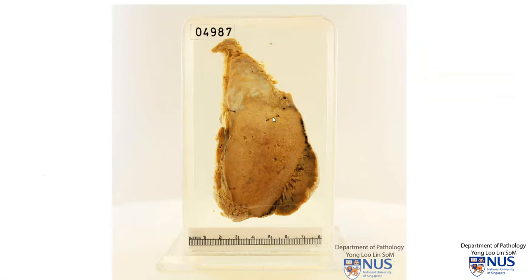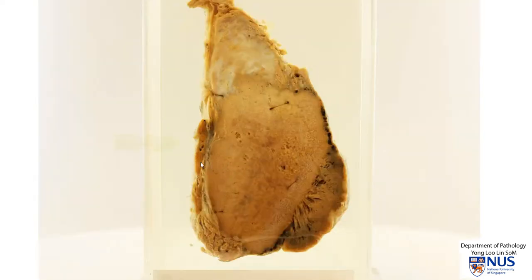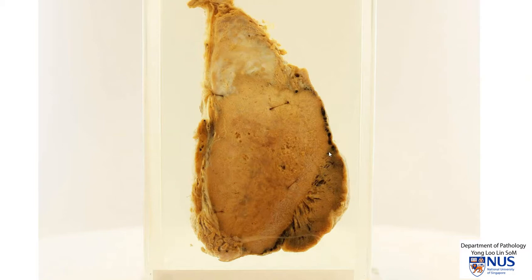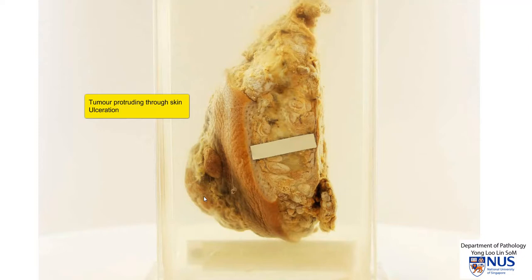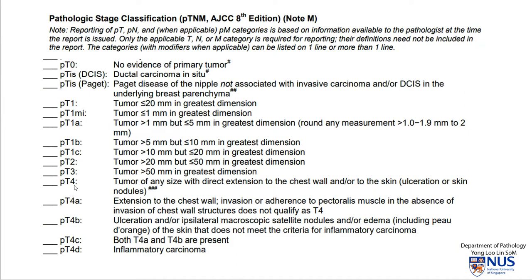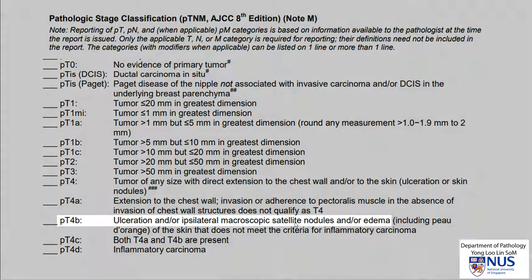Looking back at the specimen, we can assess both the deep and the superficial extent. In terms of the deep extent, this is the pectoralis muscle — so it is not the chest wall proper yet, it's still superficial to the chest wall. We can see that the tumor is fairly sharply demarcated and there is no obvious invasion into the pectoralis muscle. However, when we look at the superficial extent of the tumor, we can see the tumor has clearly broken through the skin, even apparent on the skin surface. So because of ulceration and involvement all the way through to the epidermis, this is considered skin involvement. Therefore, this will be a PT4 tumor. P stands for pathologic staging, and we can see ulceration here and involvement of the skin. So this is PT4B.